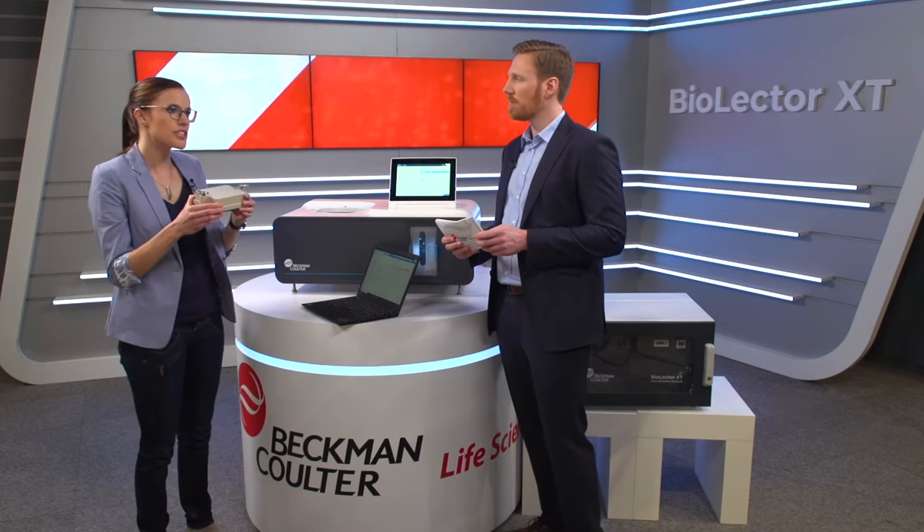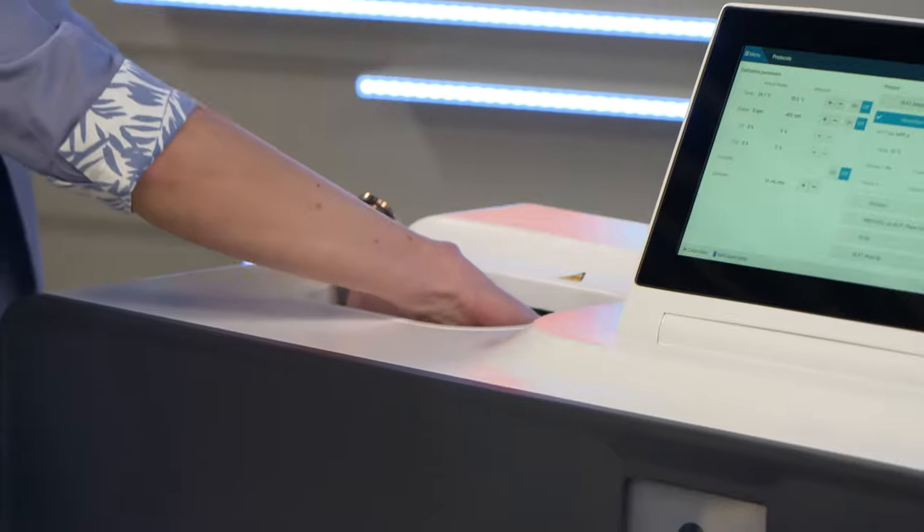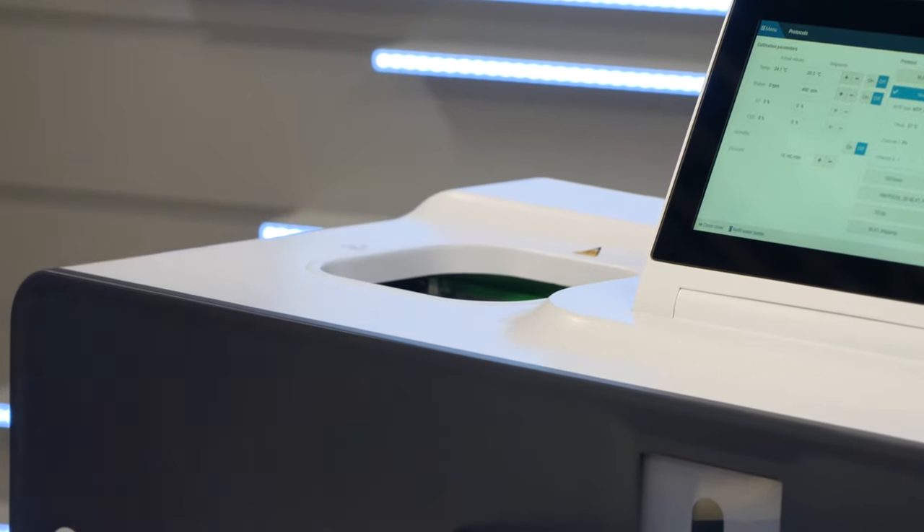After that, you put the whole unit into the incubation chamber, connect the tubing and fix the clamps. The advantage is that you don't need anything else. The airtight gassing lid acts as an anaerobic chamber — there's no need for an additional tent covering the device.